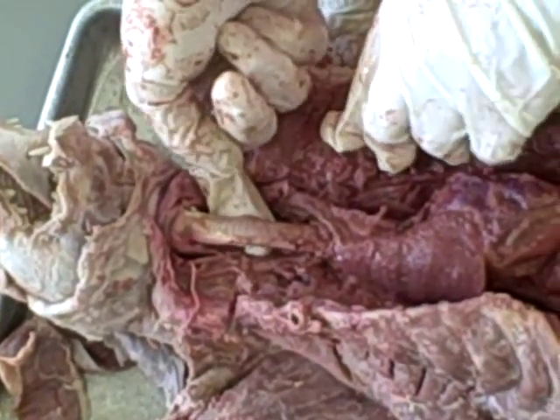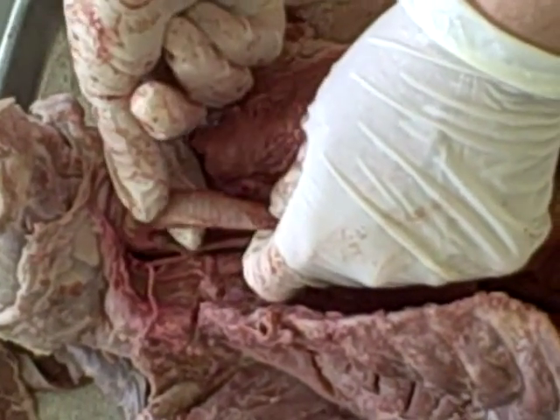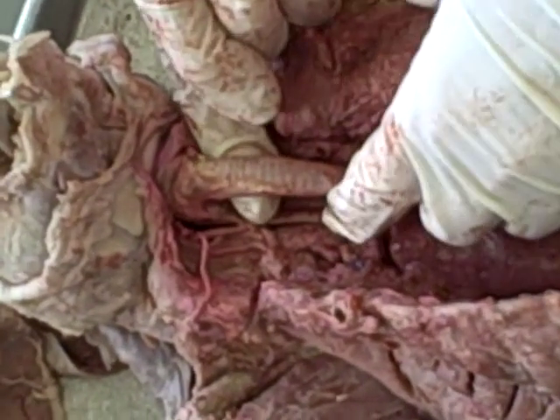Practical exam reviewing the internal organs of the cat. The first one is this firm cartilaginous tube running down the ventral part of the animal's throat. You can see the rings of cartilage giving it support.